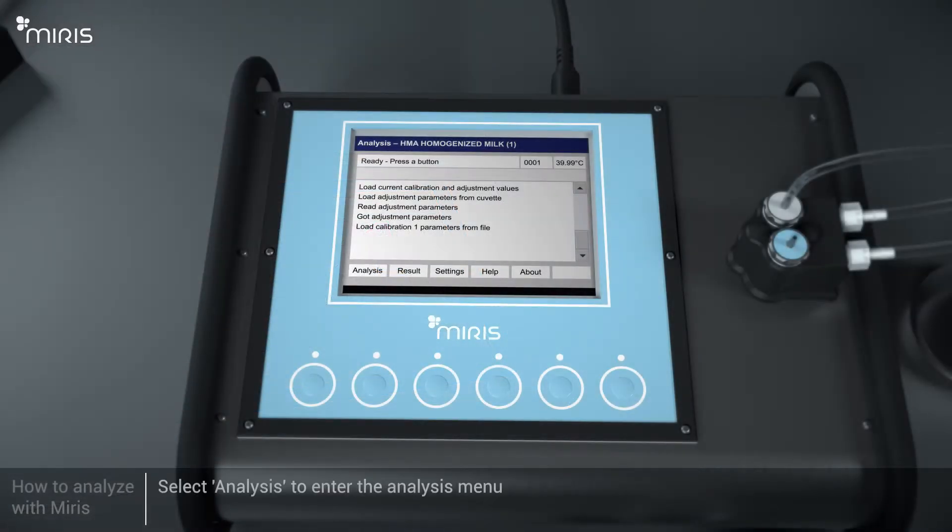On the Miris HMA, select Analysis to enter the Analysis menu.